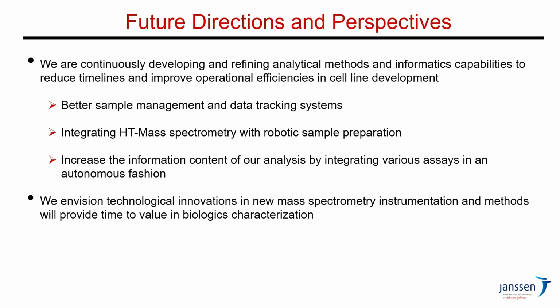So we are continuously developing and refining analytical methods and informatics to reduce the timelines and improve the operational efficiencies. We are looking at better ways to perform all these things, integrating mass spec with robotics, as well as integrating various assays in an autonomous fashion. So that's going to be the future for the next couple of years.